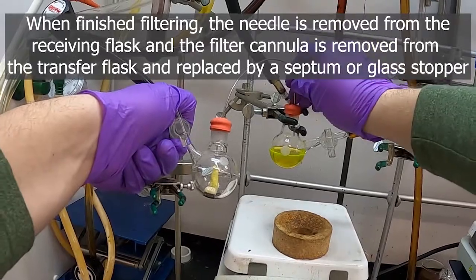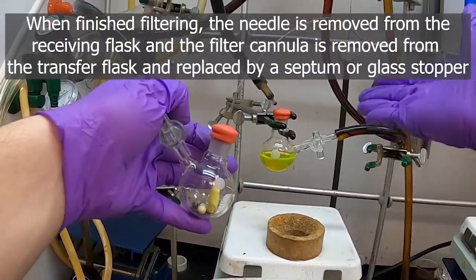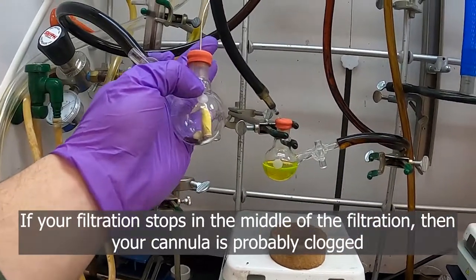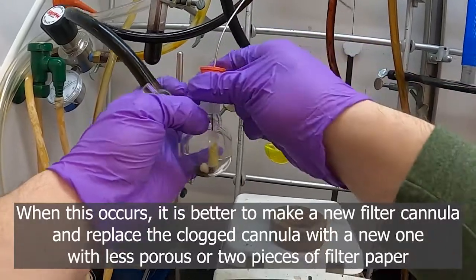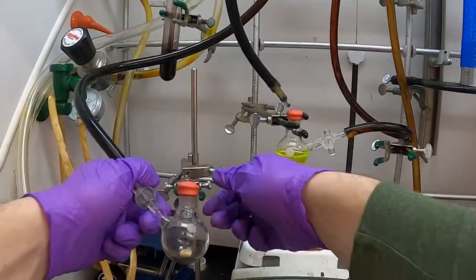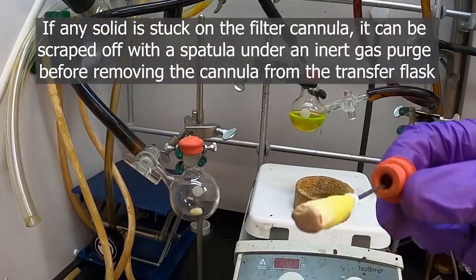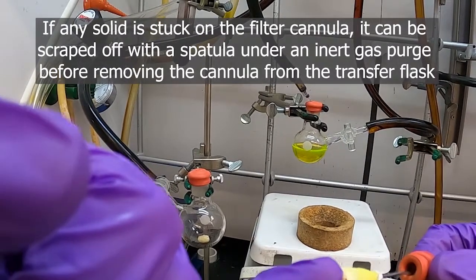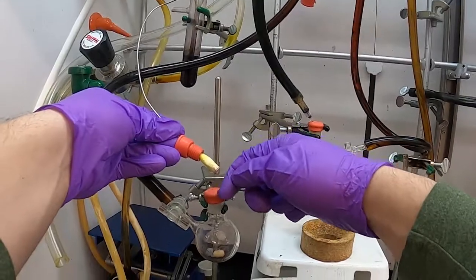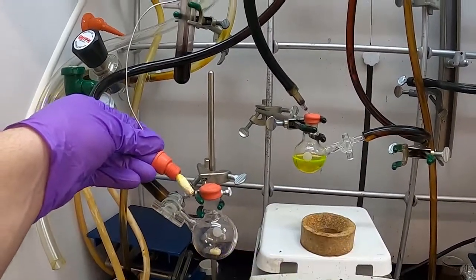Then we just reverse the process. We'll remove the filter cannula while still pushing nitrogen, then swap to a stopper and back to our septum. If your solid cakes up on the bottom of your filter cannula — the filter paper portion — when removing it you might want to remove it more slowly and have a spatula handy to scrape any solid that collected on the bottom of your filter back into your flask so it can be protected, all while maintaining the nitrogen stream coming out of your Schlenk flask through the line.